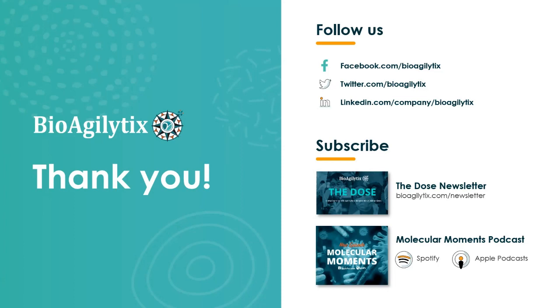Great. And is there a preference for using dPCR or qPCR for VCN or RCL testing? I think, as Amanda mentioned, and I also included in the presentation, there's a difference between digital PCR and qPCR. Digital PCR doesn't require the standard curve, so you don't have to maintain a reference standard material, and during the life cycle of the method, you don't have to bridge different lots of the reference standard material.